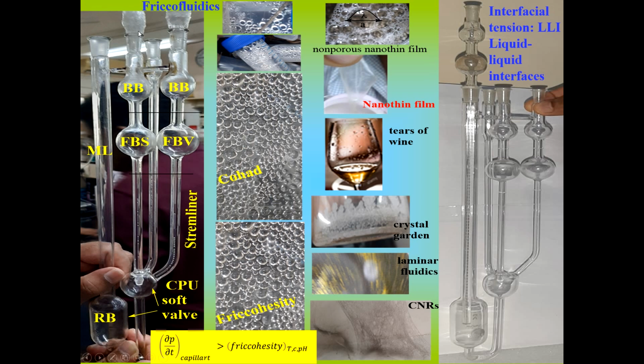So this is the pressure limb. When the sample is taken, these two limbs are closed, and when the sample is coming to this side, this also acts as a soft valve, filled with the solution, and it is also a liquid valve or soft valve, so that air from this side cannot come in contact. That's why this is the only device which can measure these physical chemical parameters in a controlled environment. A nitrogen cylinder is fitted here with these two. So nitrogen environment, slightly a little bit more nitrogen.